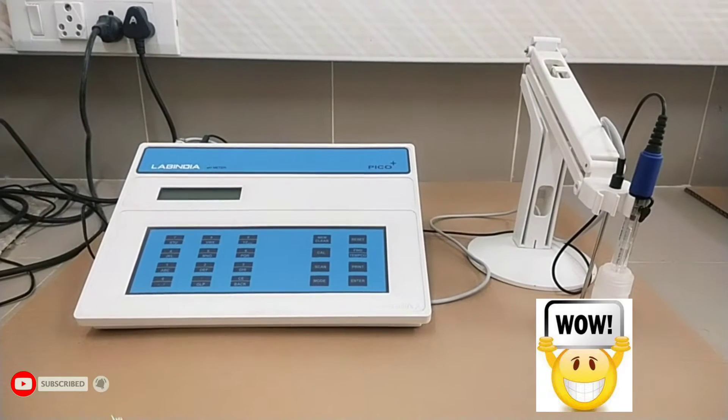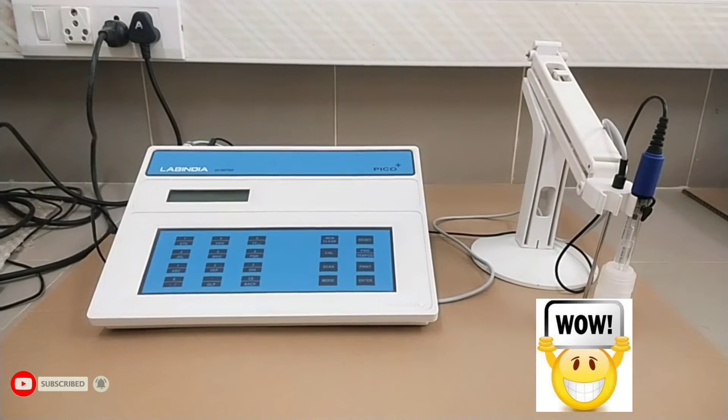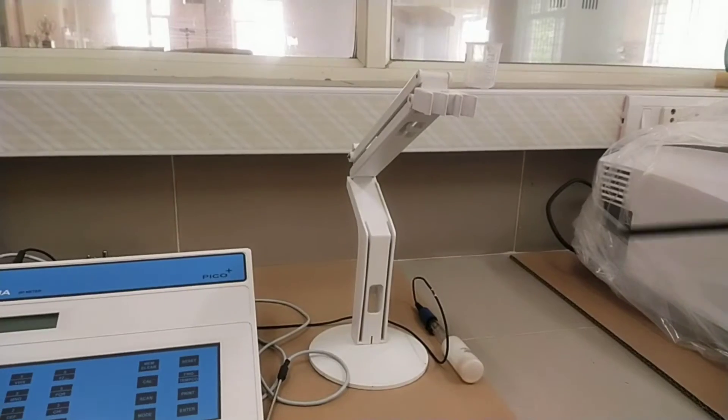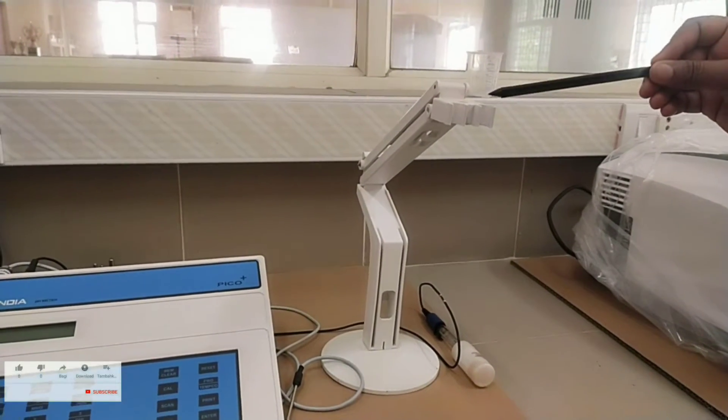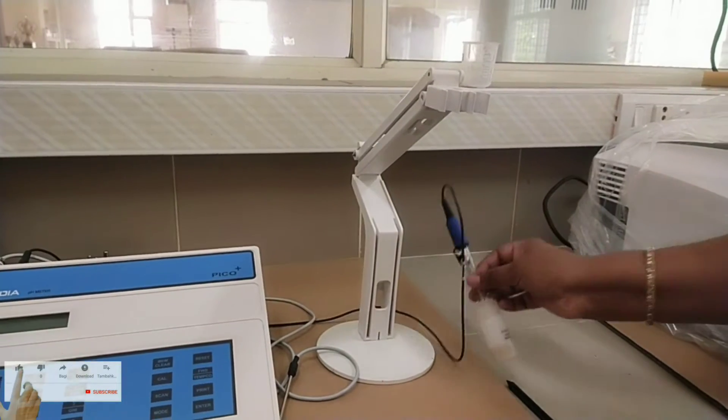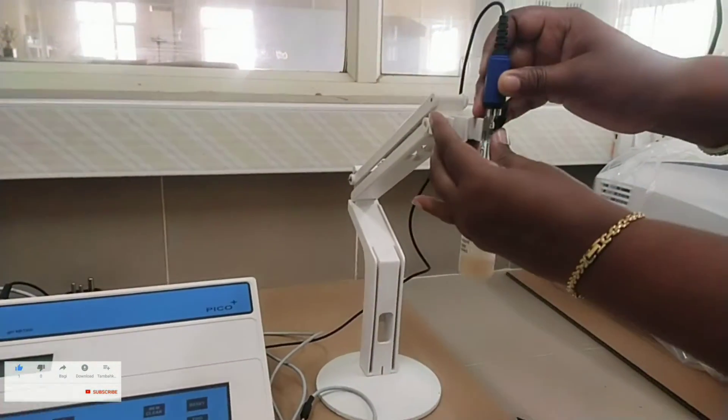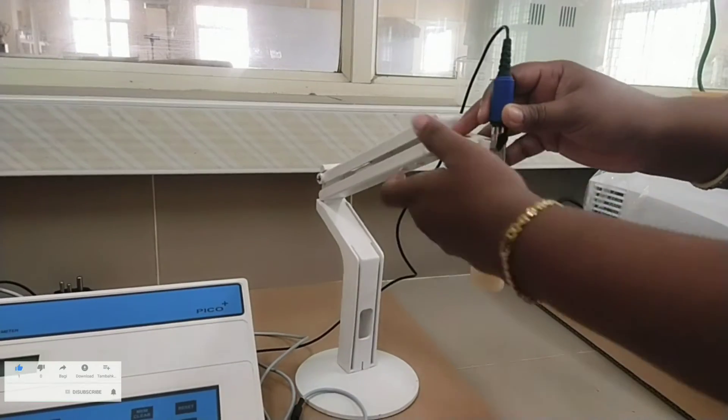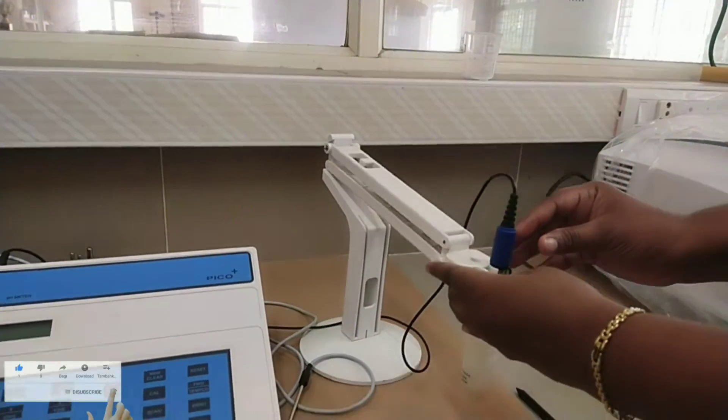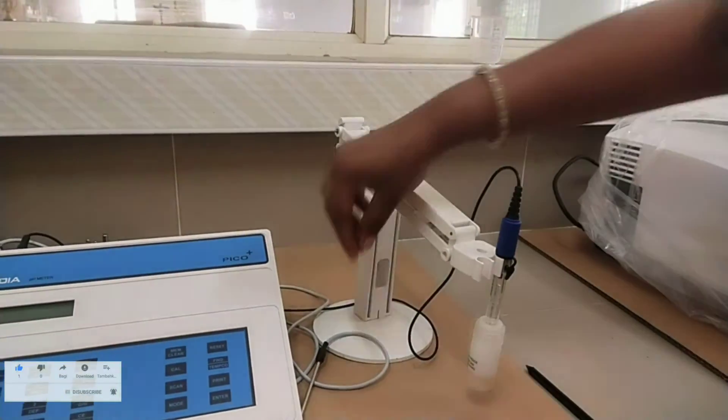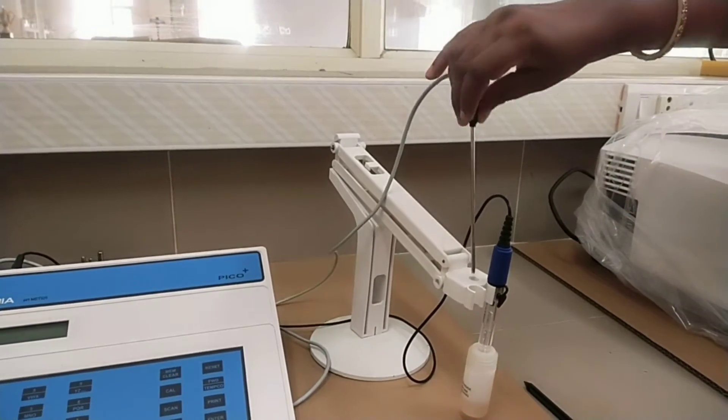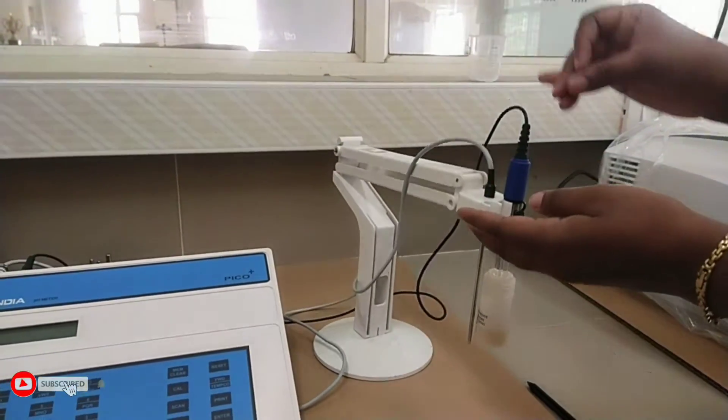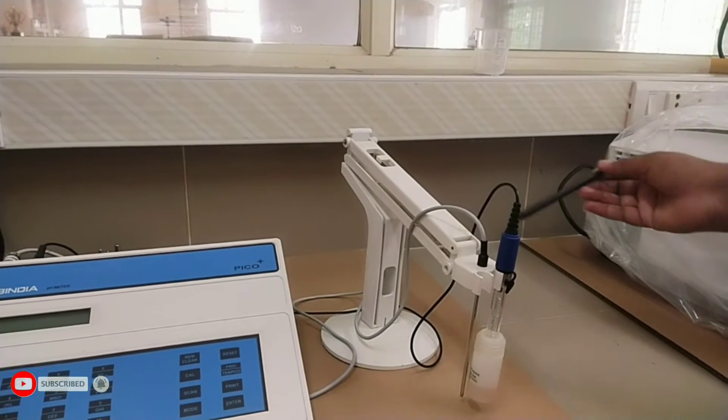Today you are looking at the advanced microcontroller based user friendly pH meter. Let us have a look one by one. This is electrode stand and holder assembly. It is electrode holder. You can observe the assembling of the pH electrode. Carefully insert the electrode from top in the holder. It is temperature sensor or temperature probe. Insert in the holder.